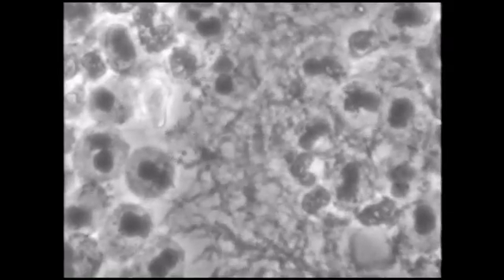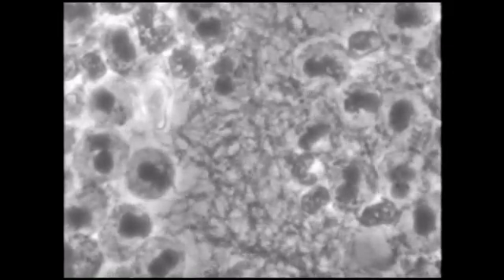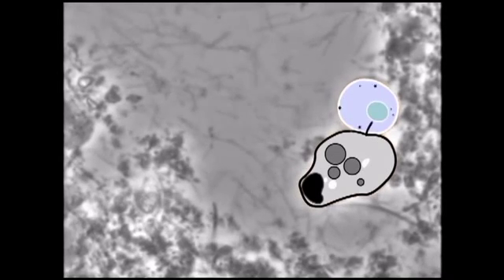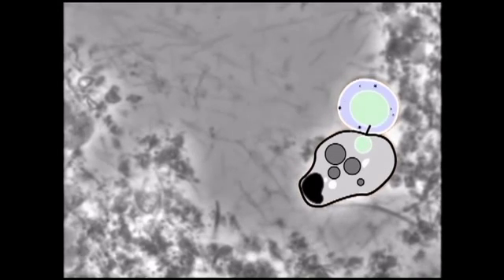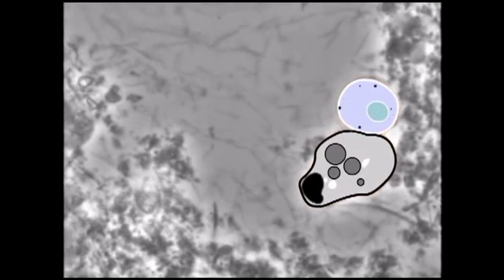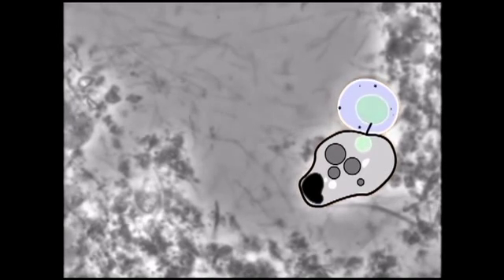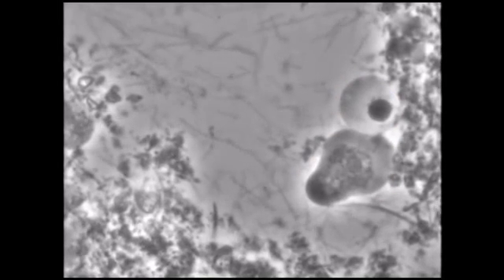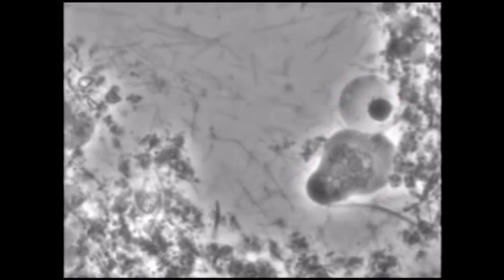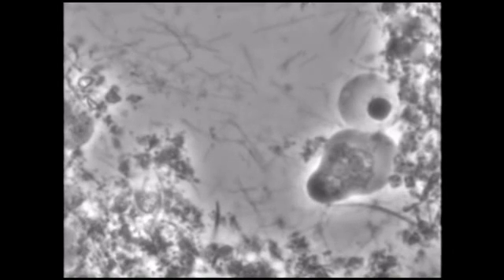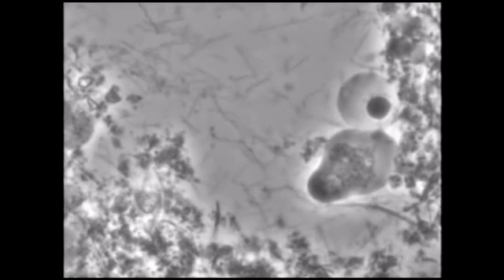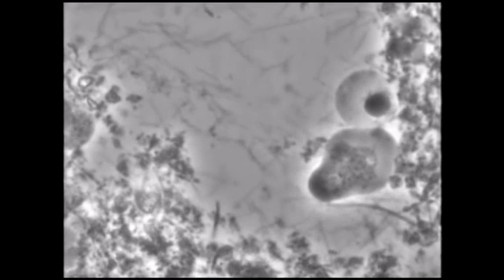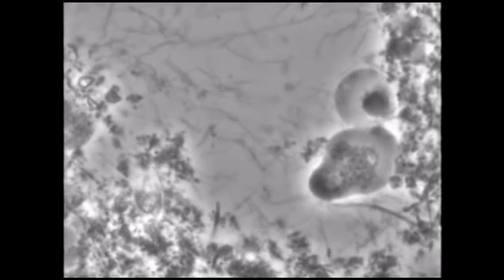This smear is almost to that level. You recognize the amoeba and the white blood cell. The amoeba appears to stick a snorkel into the nucleus of the white blood cell, and almost immediately the nucleus appears to dissolve and migrate through the snorkel into the body of the amoeba. The white blood cell dies, but in doing so it will release histamine which will call millions more white blood cells to the area. More food for the amoeba.